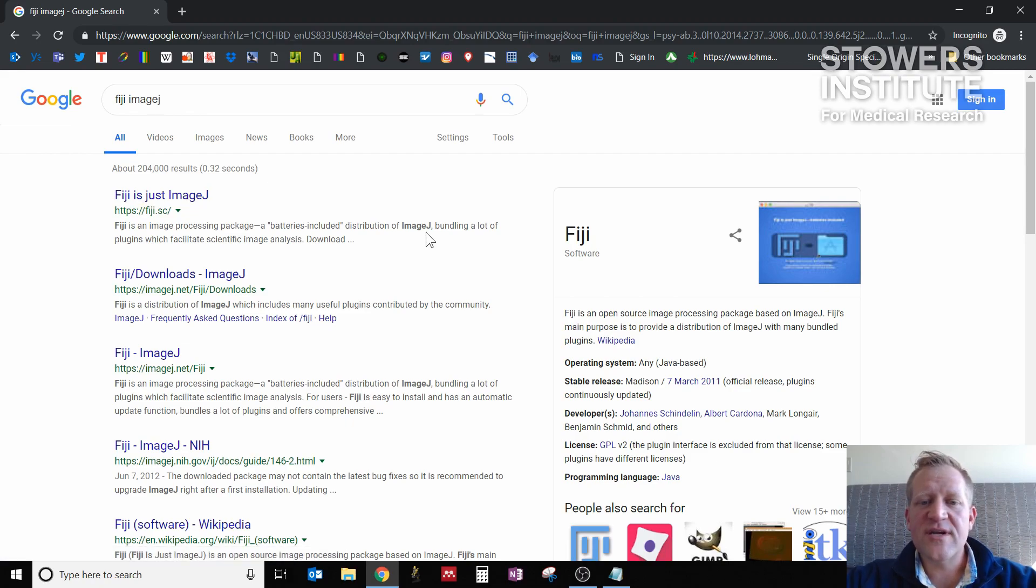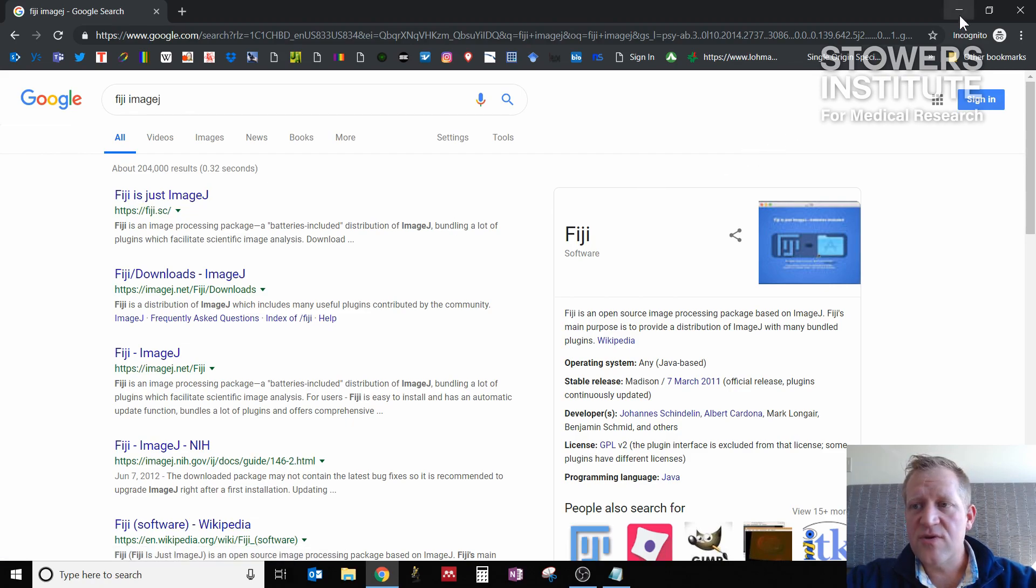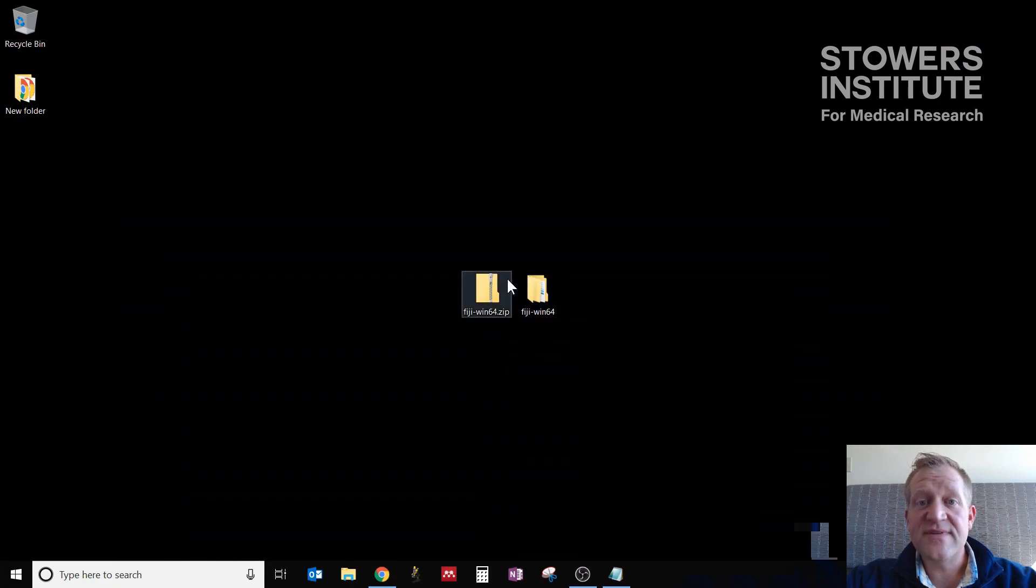Clicking through here will get you to the download location, and once you've downloaded that file, you'll get a zip file here that we have on the desktop.